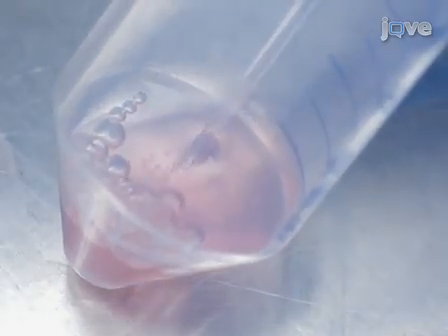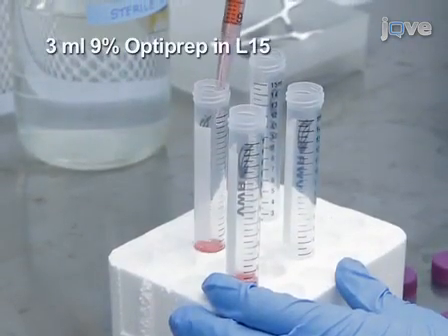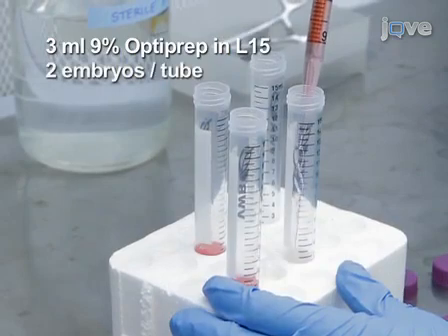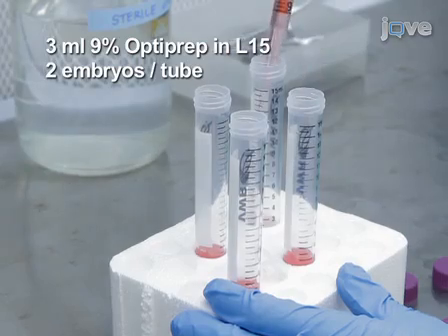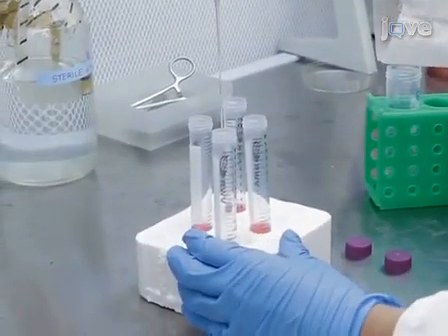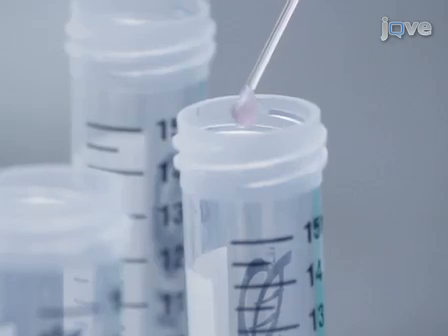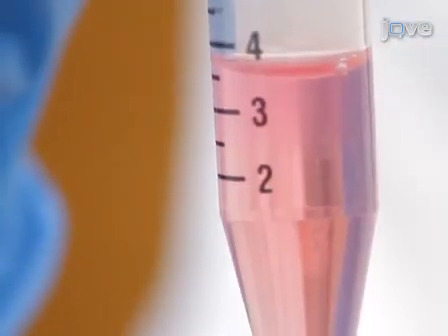Avoid bubbles. Prepare 1 tube with 3 ml of 9% OptiPrep in L15 for every 2 embryos. If there is an odd number of embryos, add 1. Drip the homogenized solution on top of the OptiPrep solution, dividing the homogenate evenly among all the tubes. The homogenate will form a visible cloudy layer on top of the OptiPrep solution.